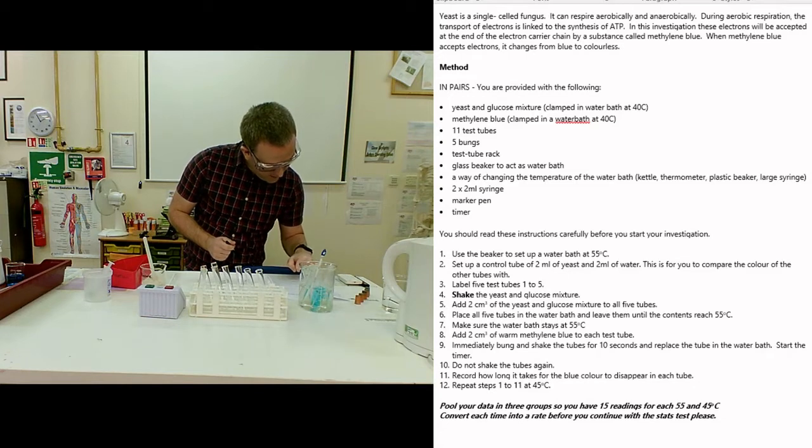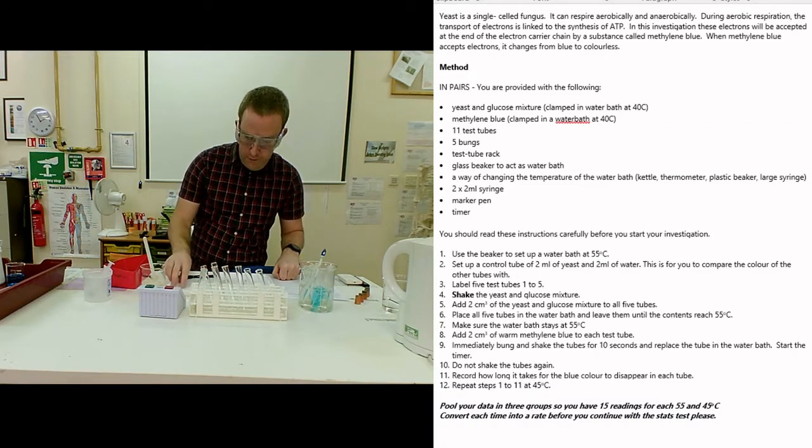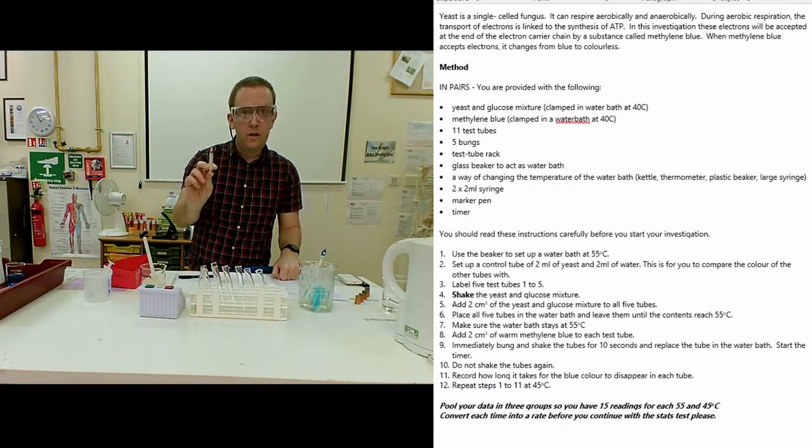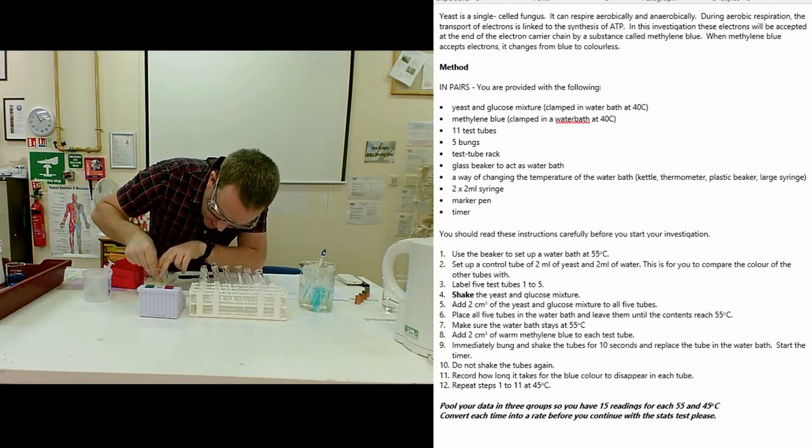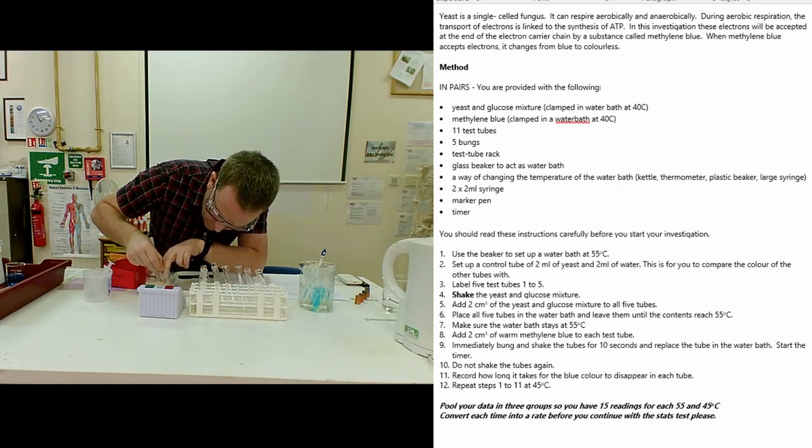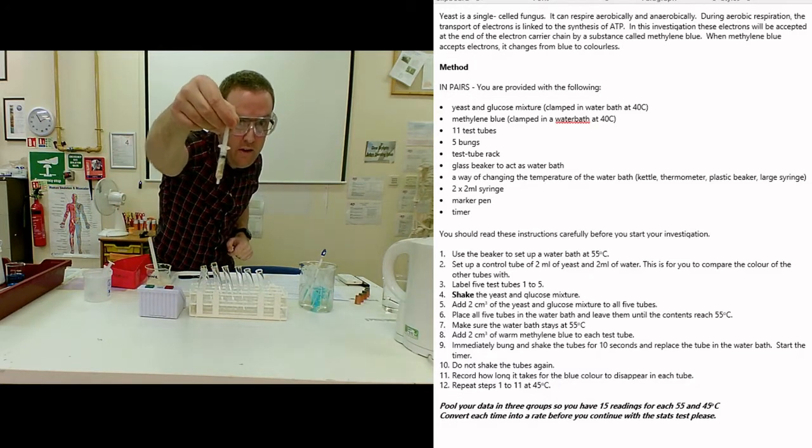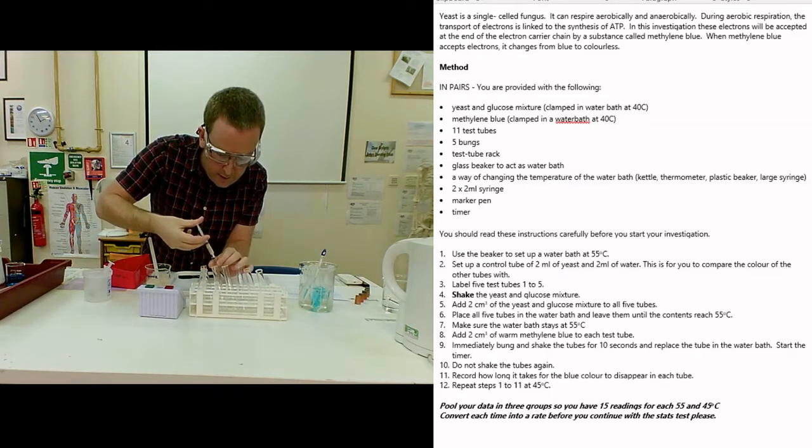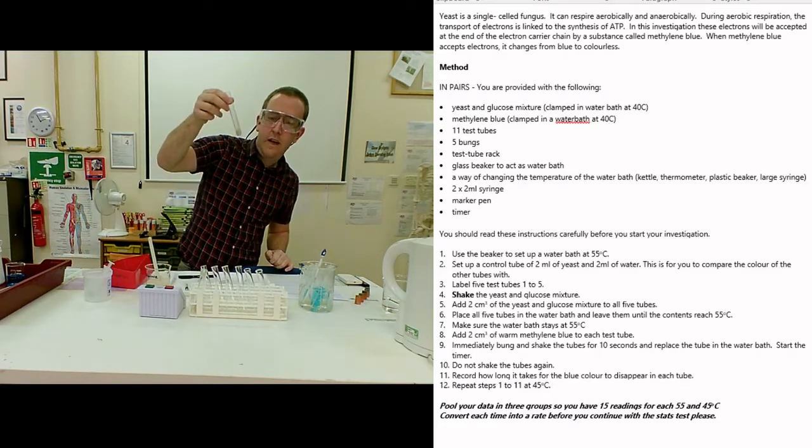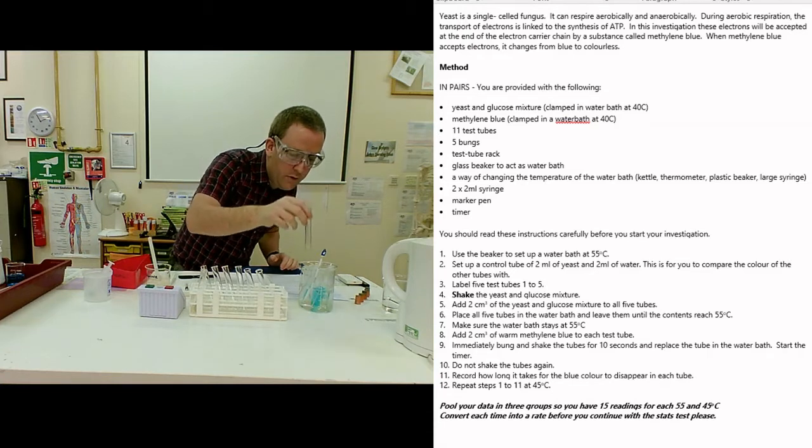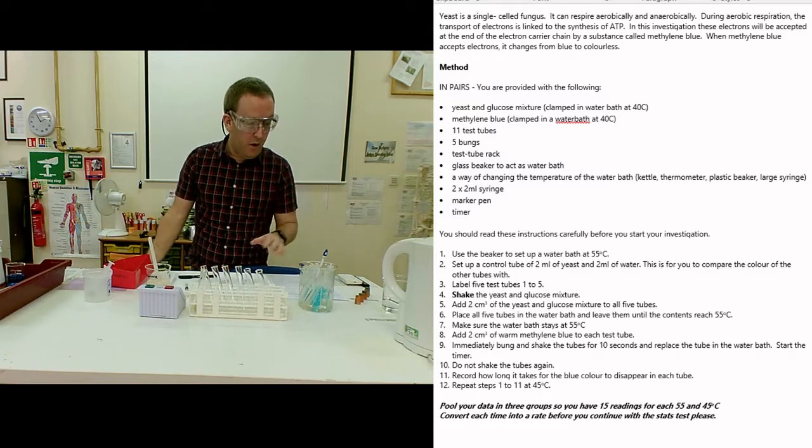Add 2 cubic centimeters of the yeast solution and glucose mixture to all five tubes. Top tip for this experiment: keep one syringe just for the yeast. What I'm going to do is go into my stock here, make sure I'm actually in the liquid not in the foam, draw that up to 2ml making sure there are no air bubbles in there, then go into one of my tubes and pop that in. I need to make sure that is at the same temperature as the tubes I'm trying to use, so I'm going to pop that into the water bath to bring that up to either 55 or 45 degrees C depending on which temperature you're doing.